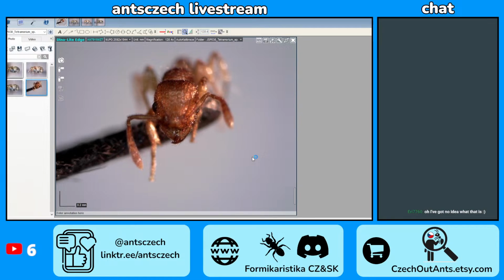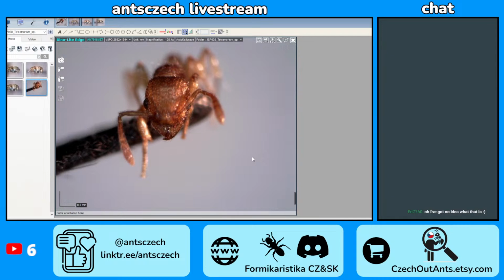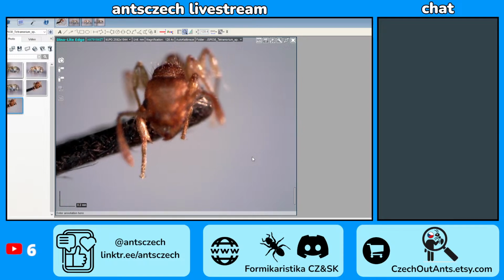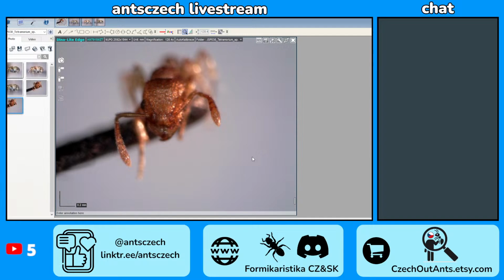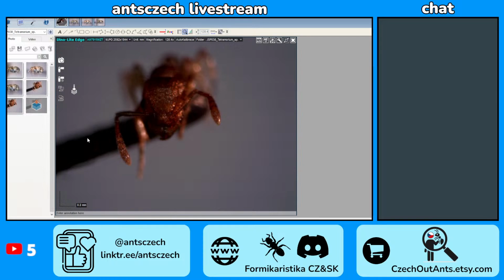Yeah, I think I saw the key. It's always so weird seeing an ant which is native to the Philippines, Indonesia, and so on, and then it's exotic to New Guinea. That makes no sense. Let's try it. Oh, okay. Wrong button.